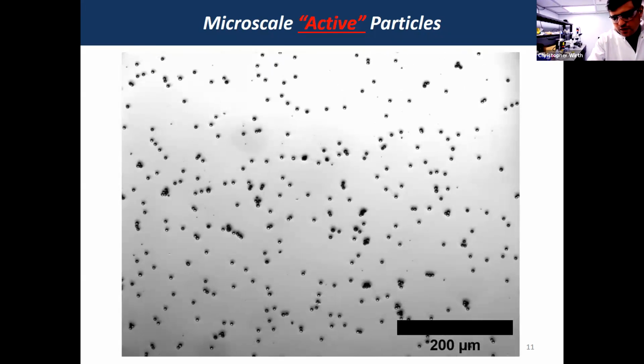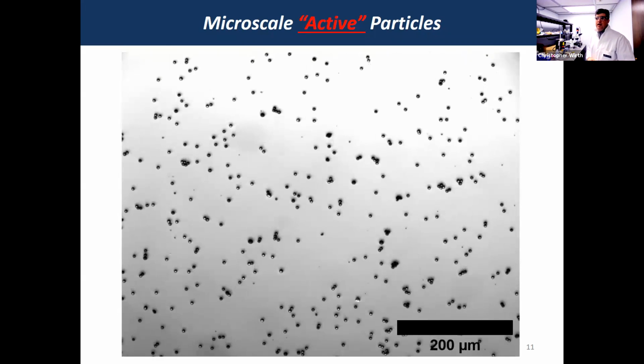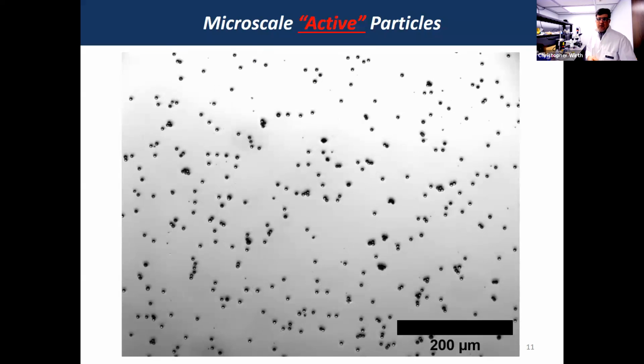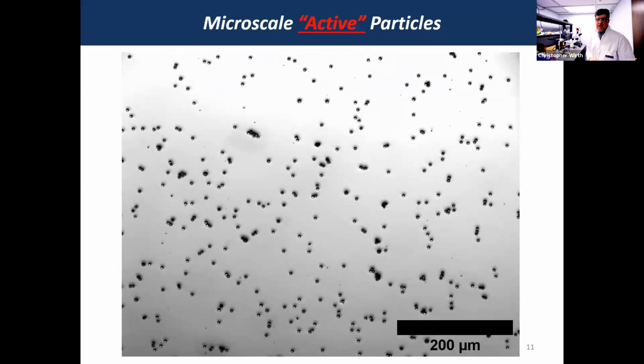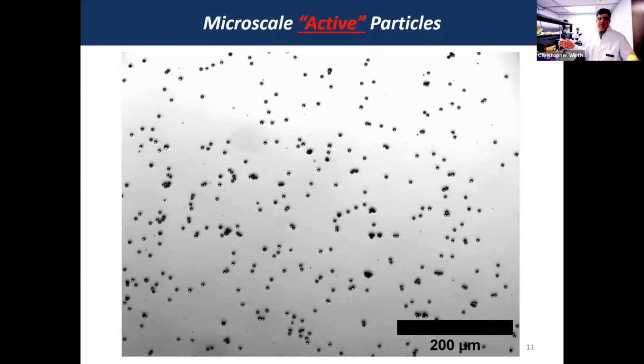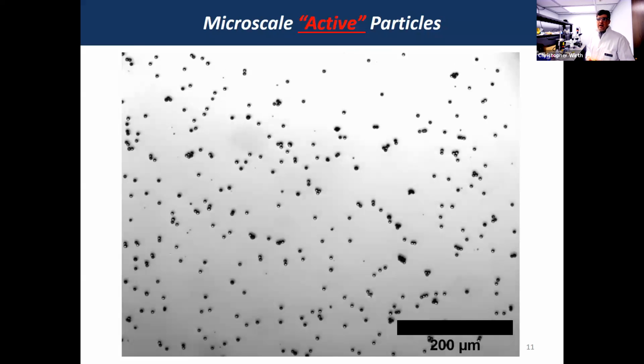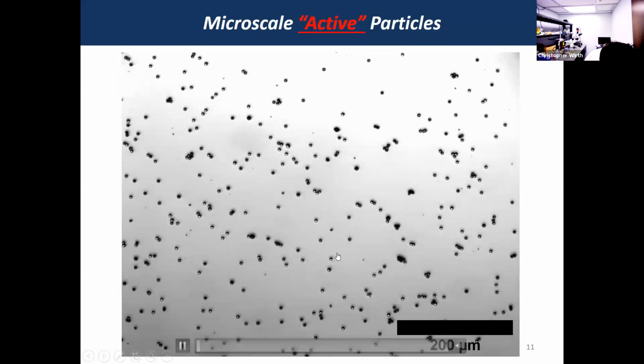Okay, so this is where we do a set of experiments on what are called active particles. Okay, so the video that you see on my screen are microscale particles. These are a fraction the size of a human hair that have been designed chemically so that they swim around on their own. And we do these experiments with a microscope because a human eye wouldn't be able to observe these things without it. So you can see the particles swimming around just like this.